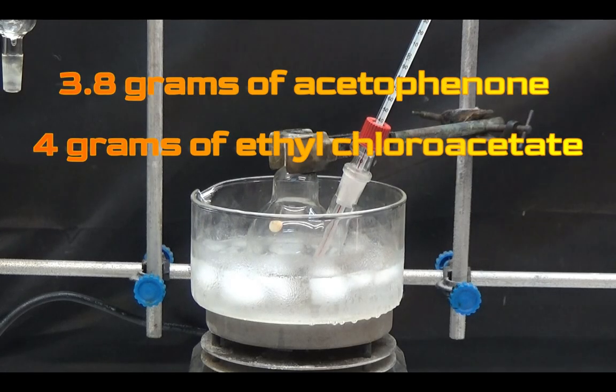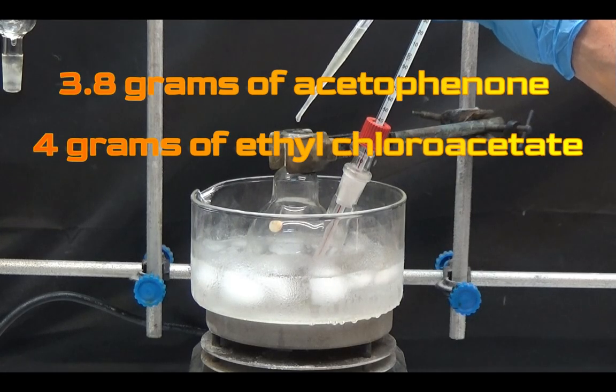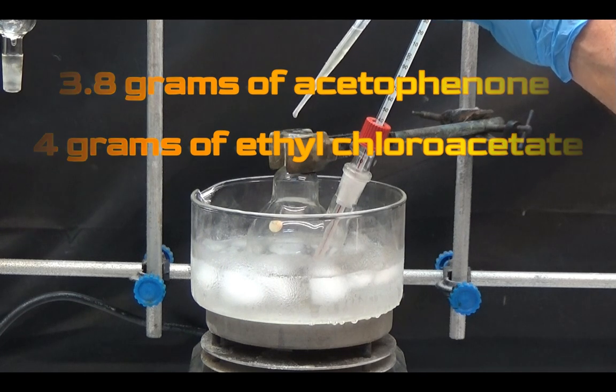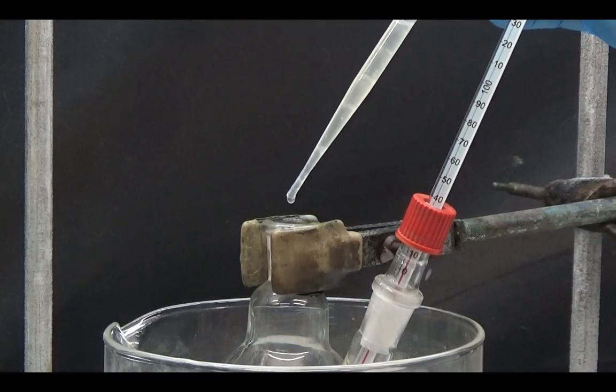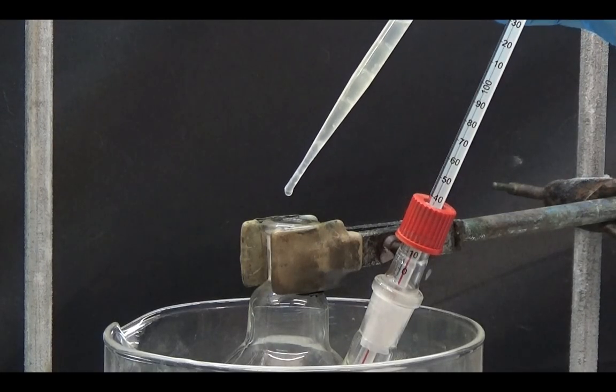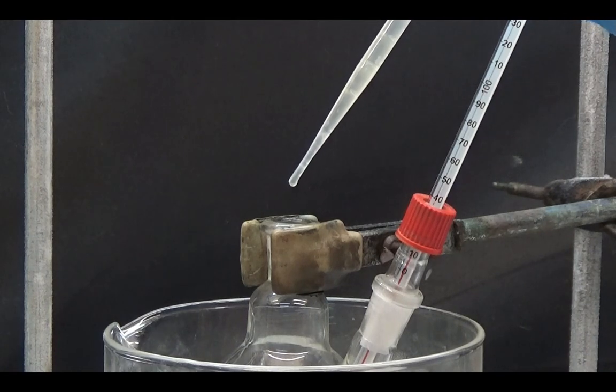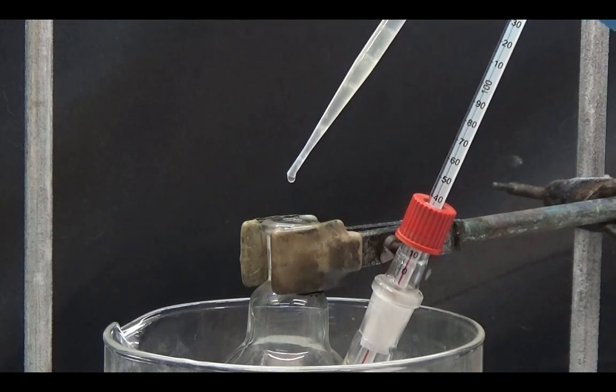3.8 grams of acetophenone and 4 grams of ethyl chloroacetate were placed in a 100 milliliter two-necked flask with a thermometer and cooled in an ice bath. With stirring, we slowly add the sodium ethoxide suspension prepared previously. It is important to keep the temperature between 10 and 15 degrees.